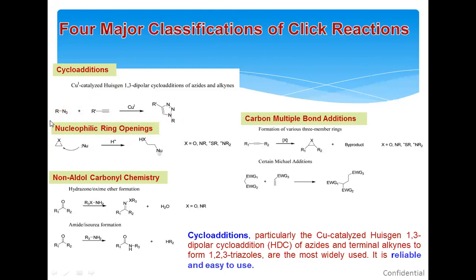The popularity is attributable to the fulfillment of these criteria, as I mentioned: mild reaction condition, high yield, simple procedure, and it's selective, specific, and reliable.